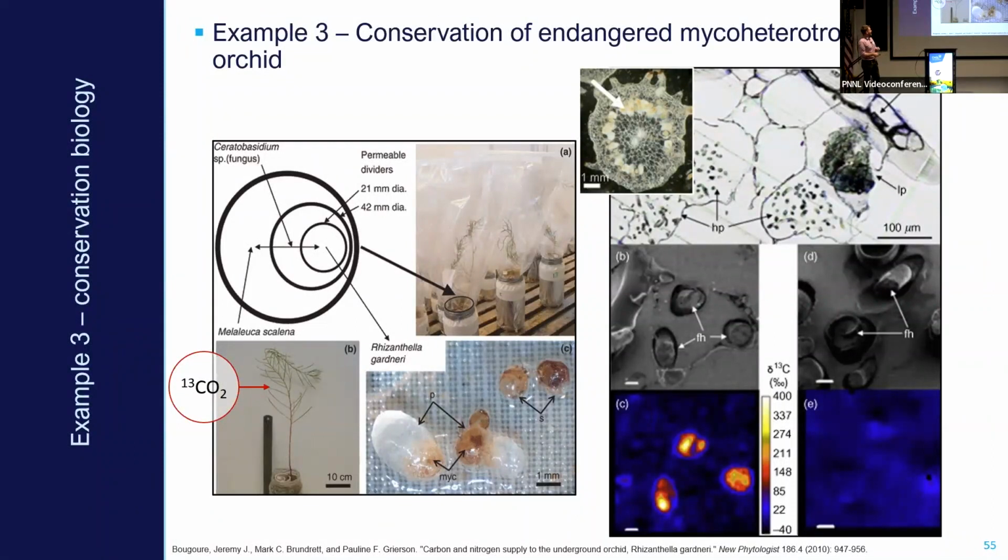Conservation-wise, it's also really powerful. It was a powerful tool for conservation purposes because it showed us that to conserve this really rare plant, we need to conserve the fungi and that other autotrophic shrub and that intricate balance of the nutrient cycling that's going on there.